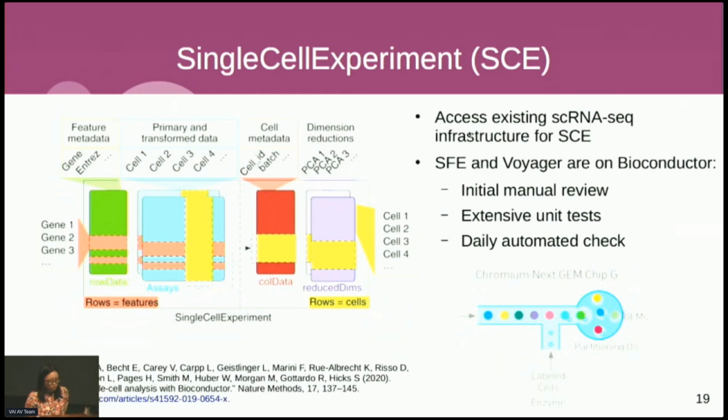An example of that is single-cell RNA-seq data. Spatial transcriptomics has inherited a lot from the non-spatial single-cell tradition, where we would dissociate the cells from tissue, losing the spatial information. And a lot of the methods for high-dimensional data analysis are still relevant for spatial. In the Bioconductor ecosystem, the SingleCellExperiment is used to represent and operate on single-cell RNA-seq data.